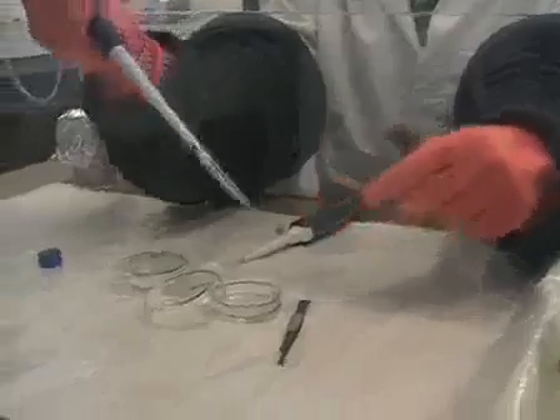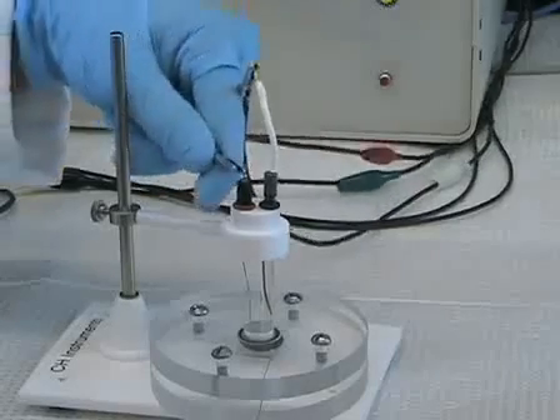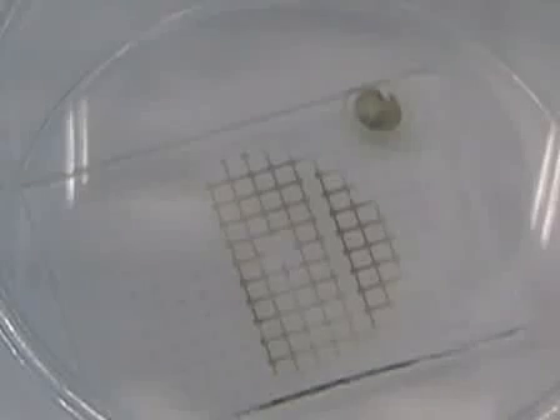In tissue engineering and regeneration, efforts have been made to mimic the microenvironment of the organ. In order to create this microenvironment in vitro, it is essential to spatially and temporally isolate cells on a substrate. We're interested in designing surfaces where we can control the location of different liver cell types. In today's experiment, we will use surface modification, microfabrication, and electrochemistry to form a surface that can be switched from cell non-adhesive to cell adhesive.